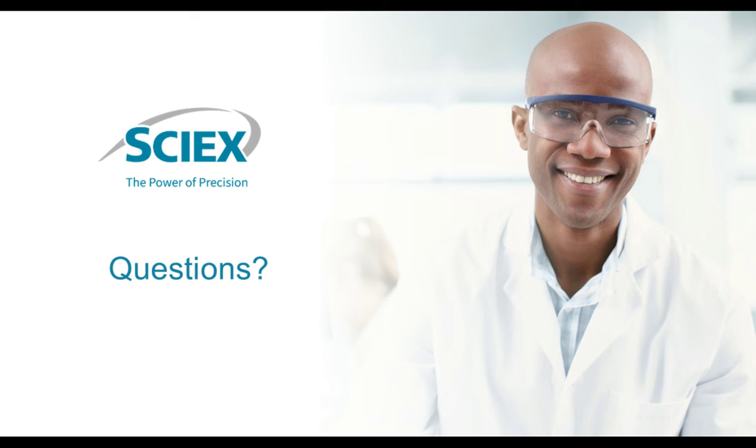Handy, does the method conversion tool take existing 32 Karat methods and transfer them to Empower? No, it does not. The method conversion tools only migrate existing methods from version 1.2 to 1.3. If you're currently running 32 Karat, we do have a step-by-step guide in the user guide to create a method, or you can utilize our method templates as a starting point, so that you can get it up and running quickly.